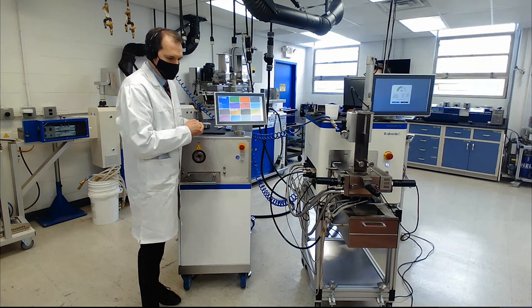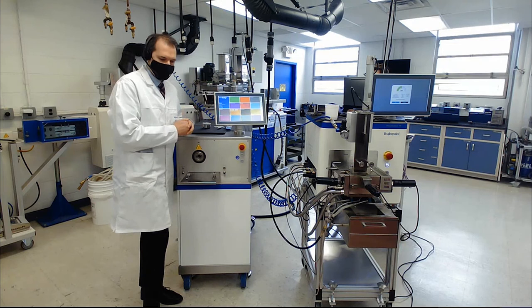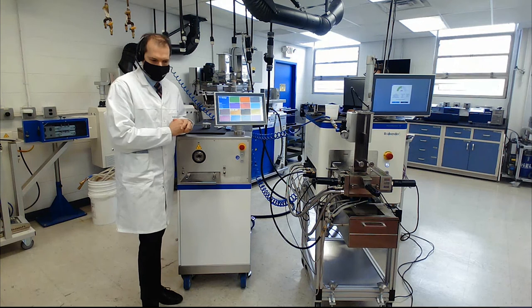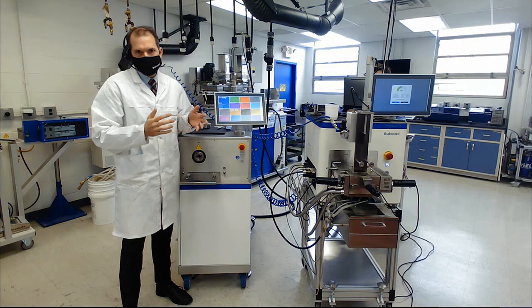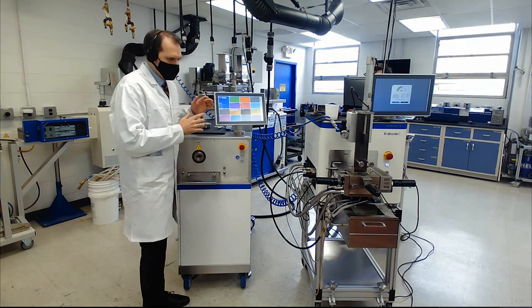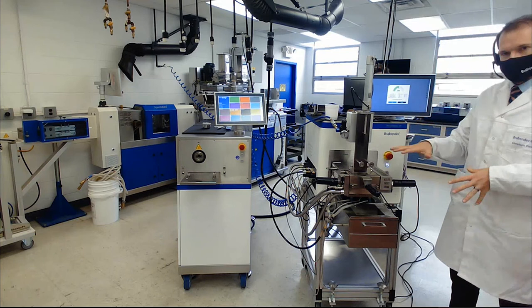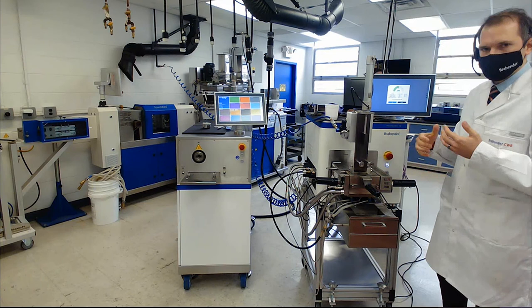You can just go and start. The nice thing is this is a software that is HTML based, so as long as your system is in the network you can log in from any device like a smartphone, tablet, or another office PC and see what is going on on that device. This also gives us a huge capability for update and services as well. I'm going to start the test. I set it here with the mixer where I have a three piece mixer 55 cc with roller blades for material characterization. I set the temperature for my rigid PVC to 185, so I'm going to click okay.